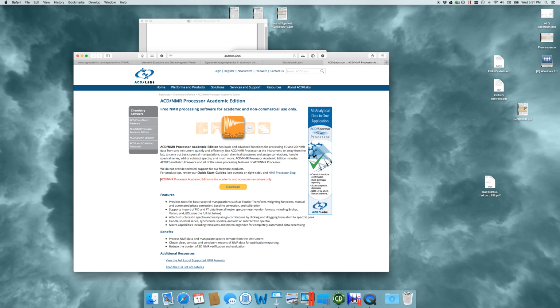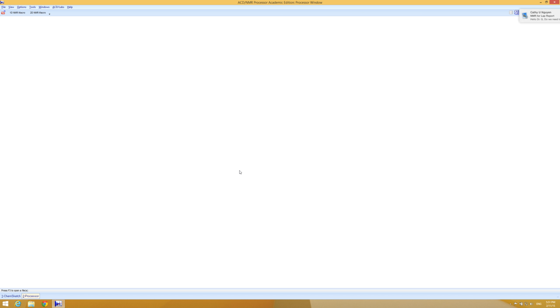Now, it's a PC only program, so if you're lucky enough to have a Mac, you're going to have to emulate Windows, but if you're on a PC, it's pretty easy to do. You download it, and then you run it, and let's go to a PC real quick. Oh, look, I'm at a PC.